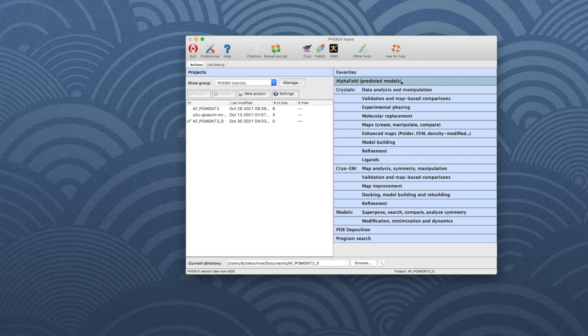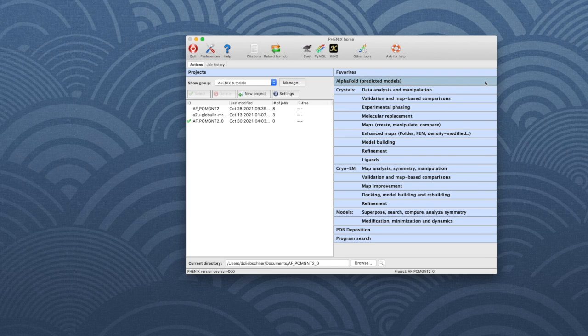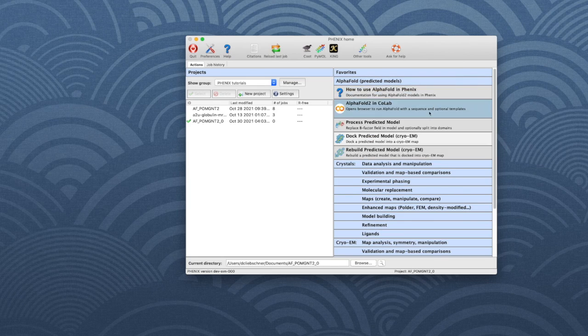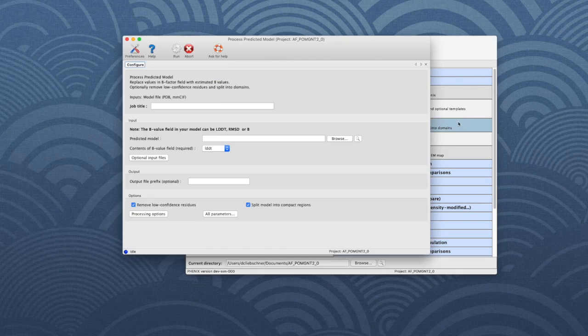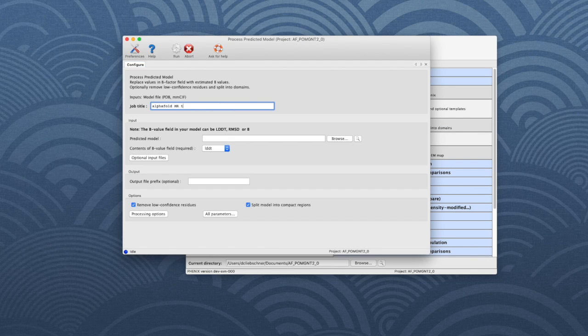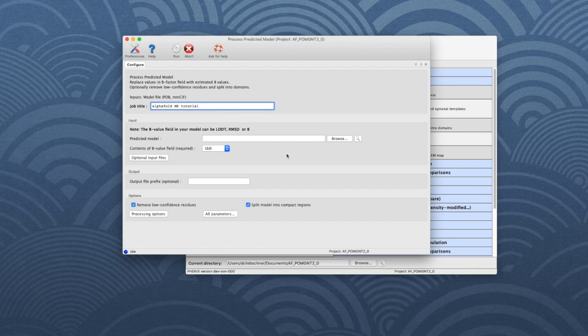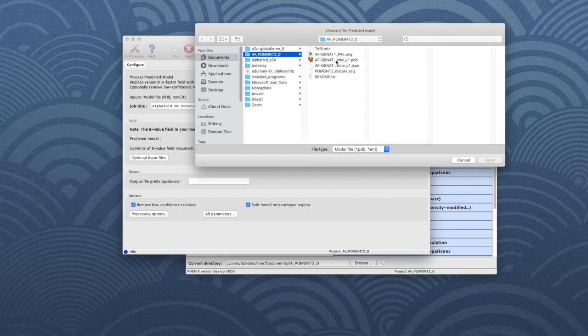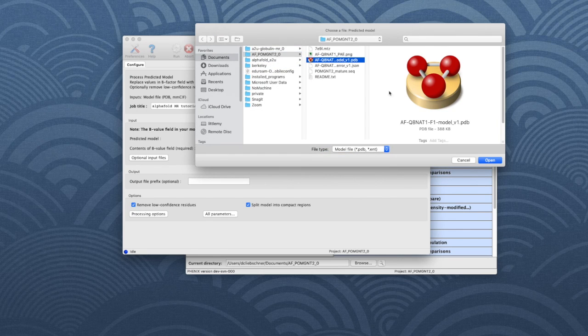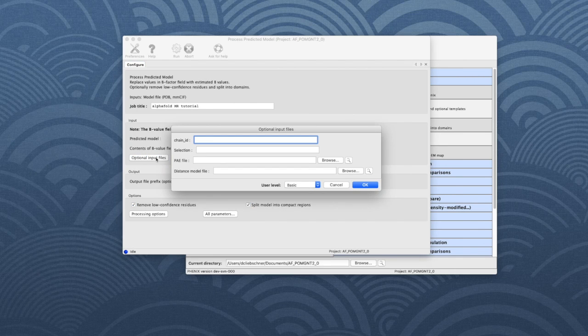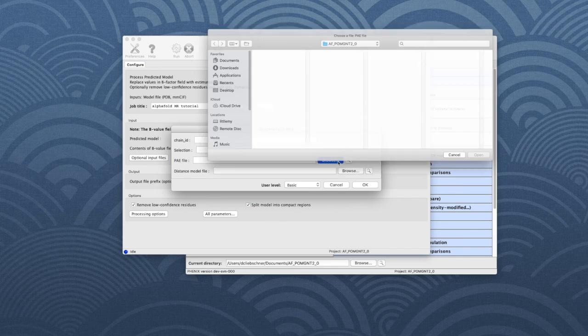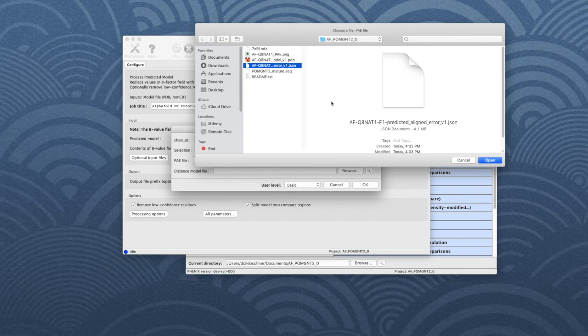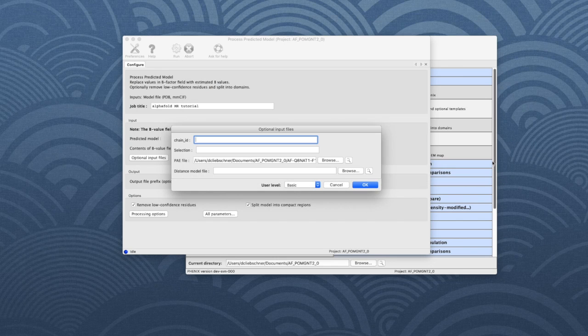Go to the Phenix GUI. In the panel on the right-hand side, choose AlphaFold and then process predicted model. For bookkeeping, put a job title. To enter the predicted model, click Browse and choose AF-G8NAT1-F1-model_v1.pdb. Then click on optional input files and click Browse next to the PAE file input field. Choose the .json file in the tutorial directory, which contains the predicted aligned error matrix. Click OK to close the window.